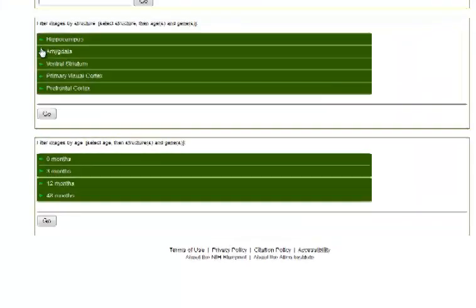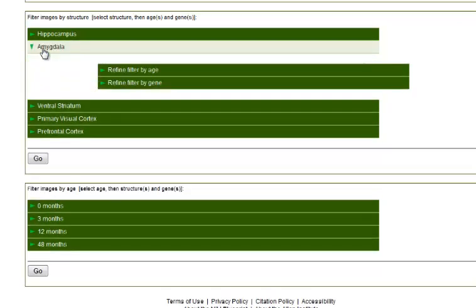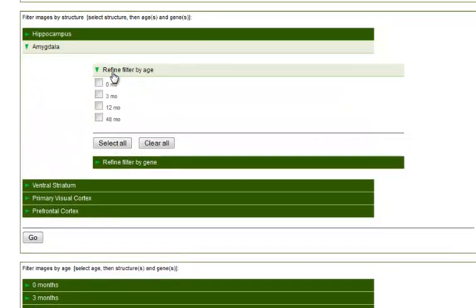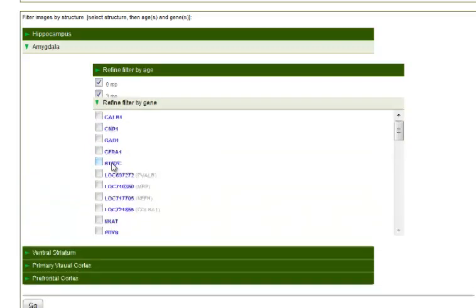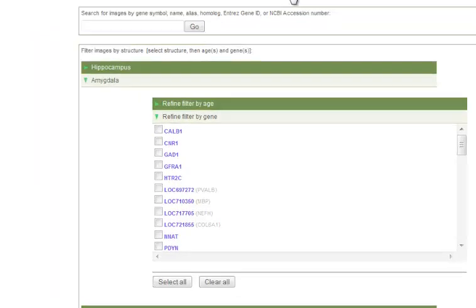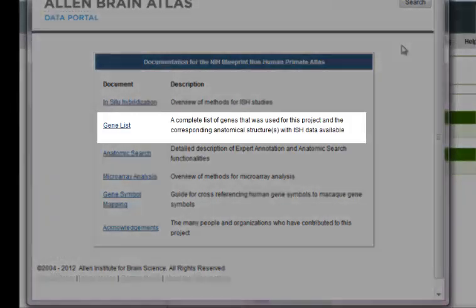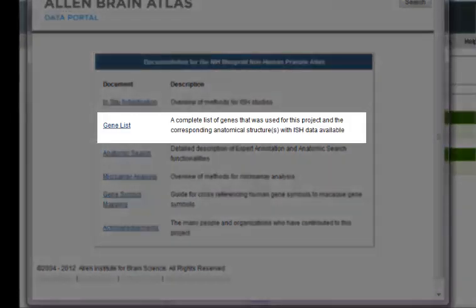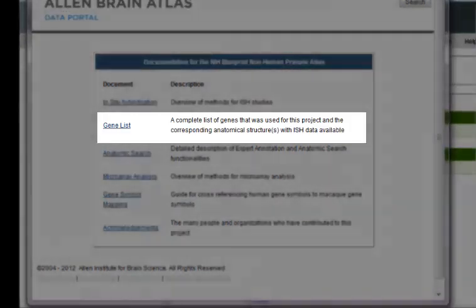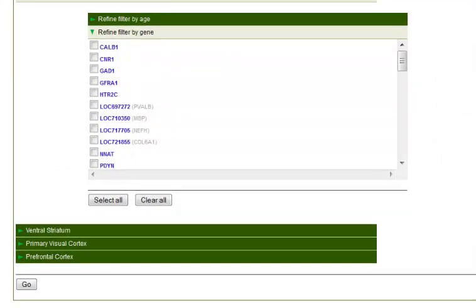Going back to the search, you can also limit your search using the temporal or structural filters. First, select either a structure or an age to begin your search. I'll also select all the ages, and then you'll need to select a gene. You can choose a gene from the list, or if you're interested, please go to the documentation page to see the full gene list. I've selected ProDynorphine in this example, and then click Go.